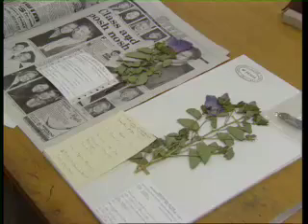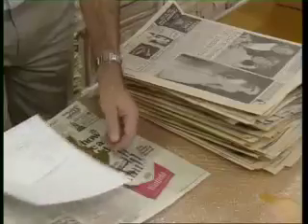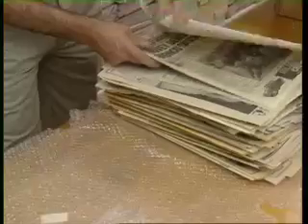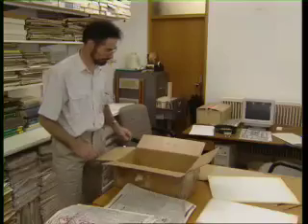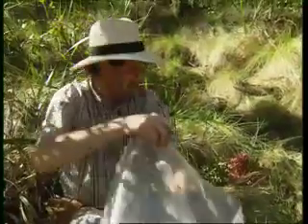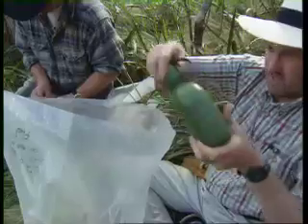Duplicates, or replicates, are multiple specimens of the same taxon collected at the same time and place — give these the same collecting number. It's common to collect enough material for several herbarium sheets. One or two sheets will be kept in the herbarium you work in; the others could be swapped for other specimens with herbaria across the country and around the world. Material is sent after pressing, drying and labelling. Using the plastic bag technique, your specimens collected at an individual site are placed into the one bag. Adding a little water to the bag reduces wilting.